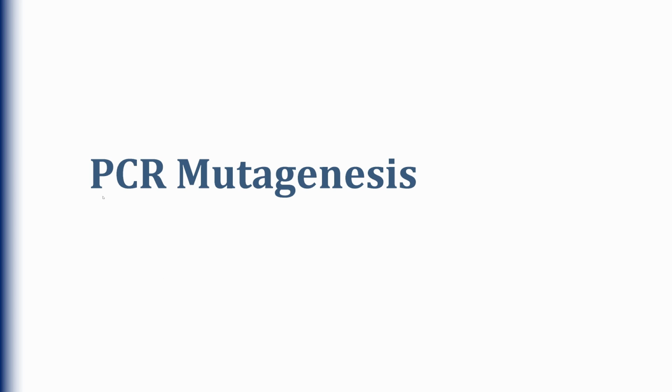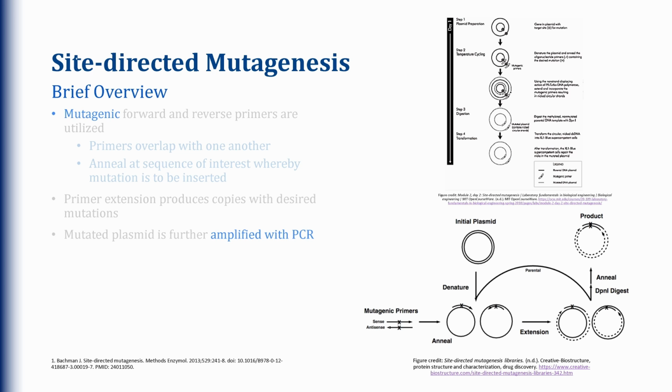Hello and welcome to this module on PCR mutagenesis. So let me begin by discussing site-directed mutagenesis and doing a brief overview of that. So in site-directed mutagenesis, mutagenic forward and mutagenic reverse primers are utilized.